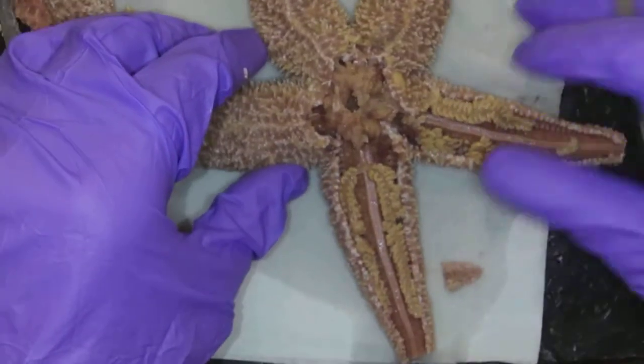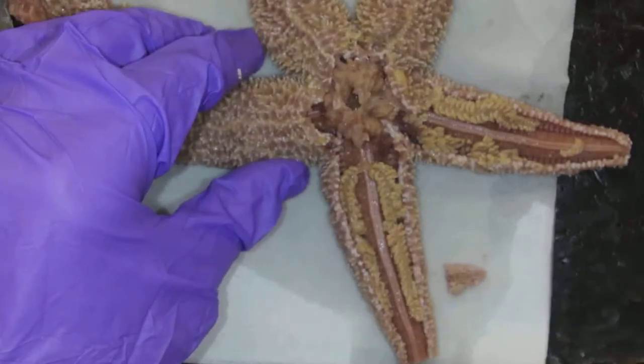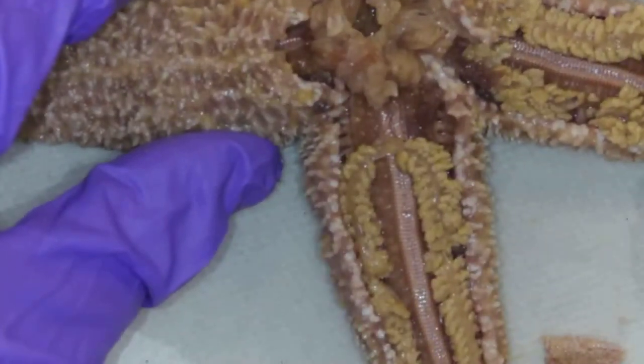Alright, so let's start with this arm here, and I'm going to zoom in just slightly.